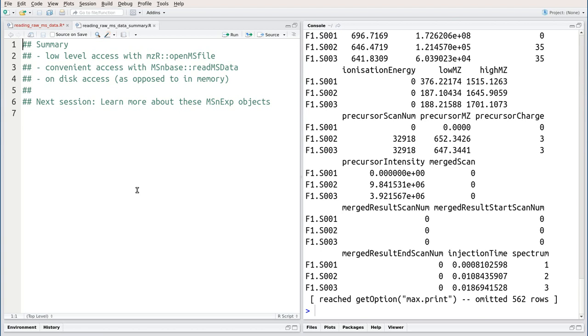In the next session, we're going to learn more about these MSnExp objects and how to manipulate this raw data.